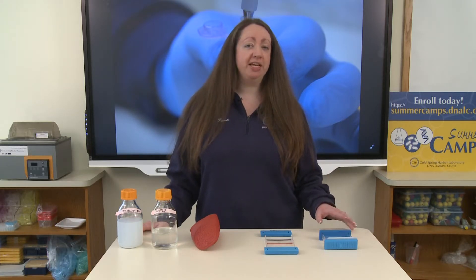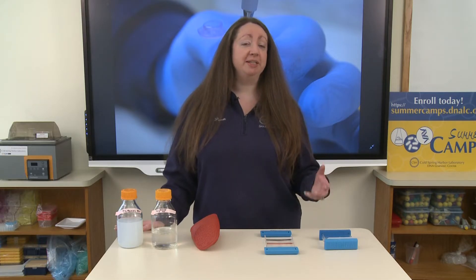Hello. Today we're going to talk about how to pour an agarose gel. Agarose gel electrophoresis is a useful technique for observing different sized fragments of DNA.